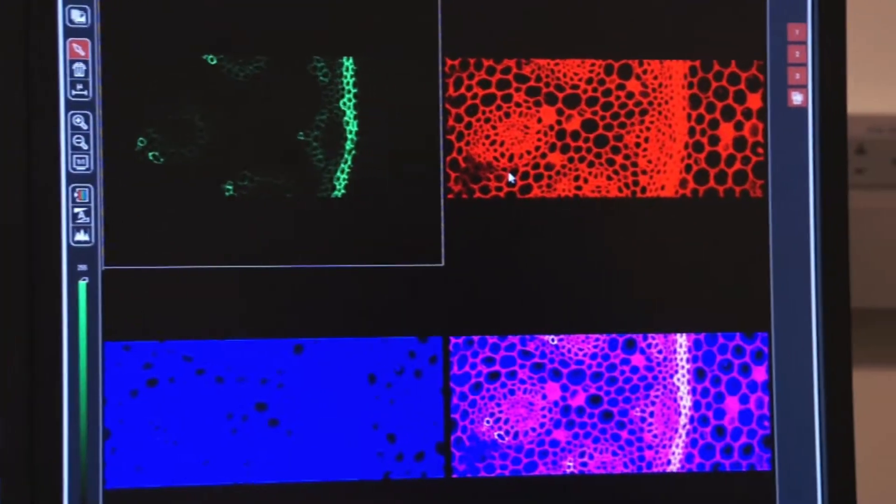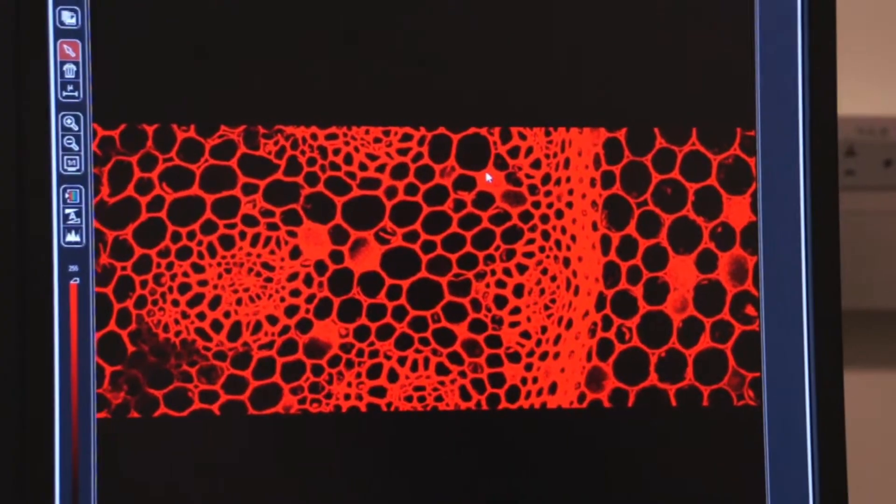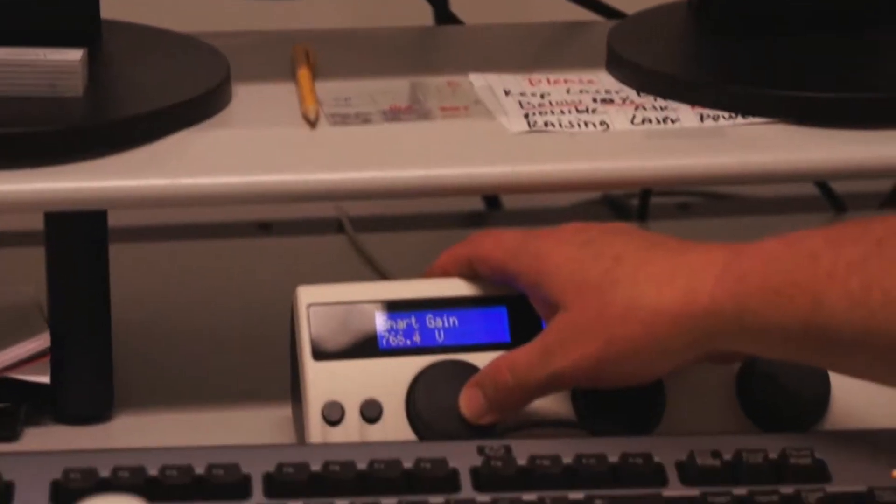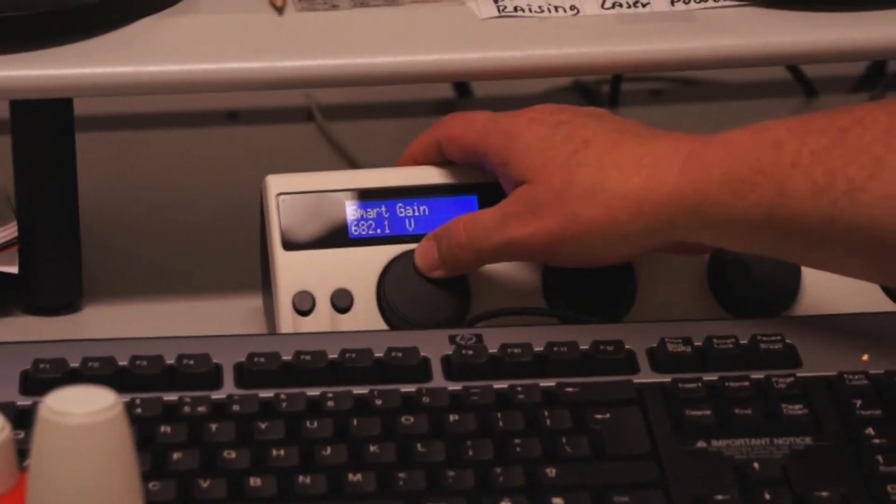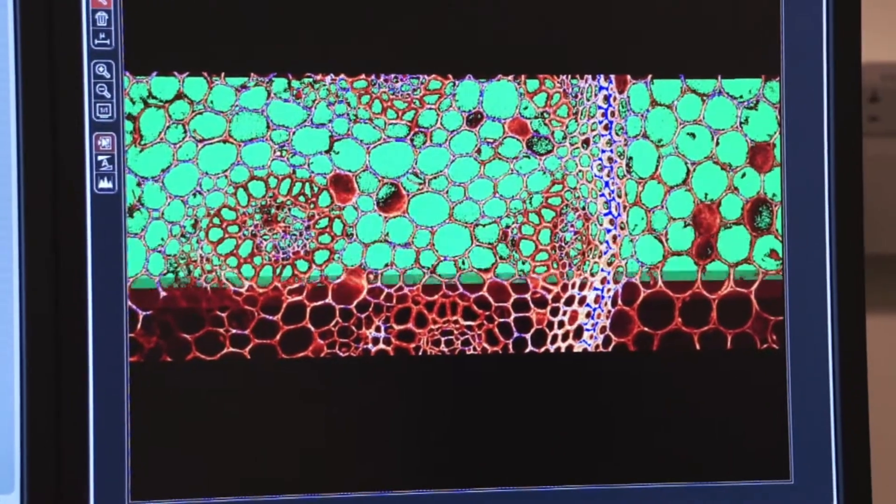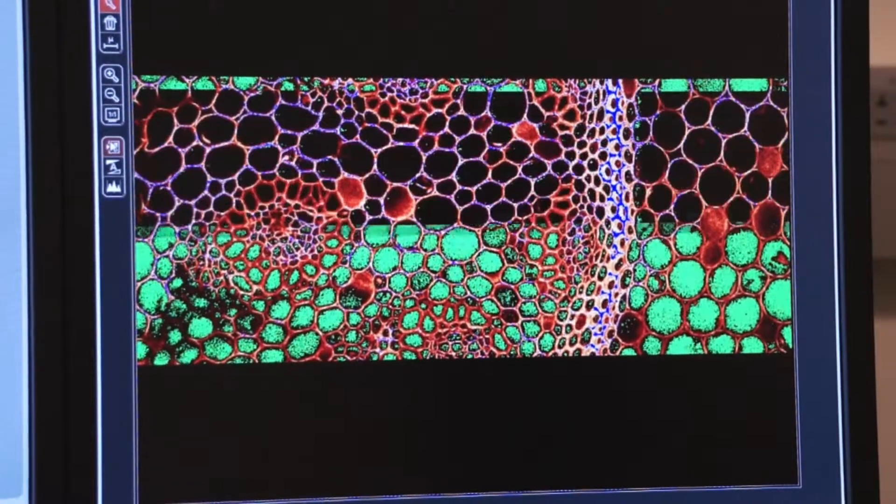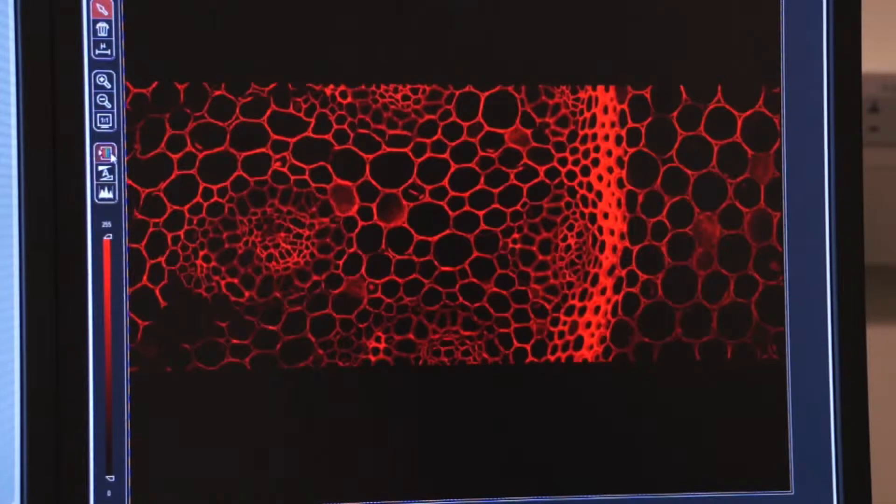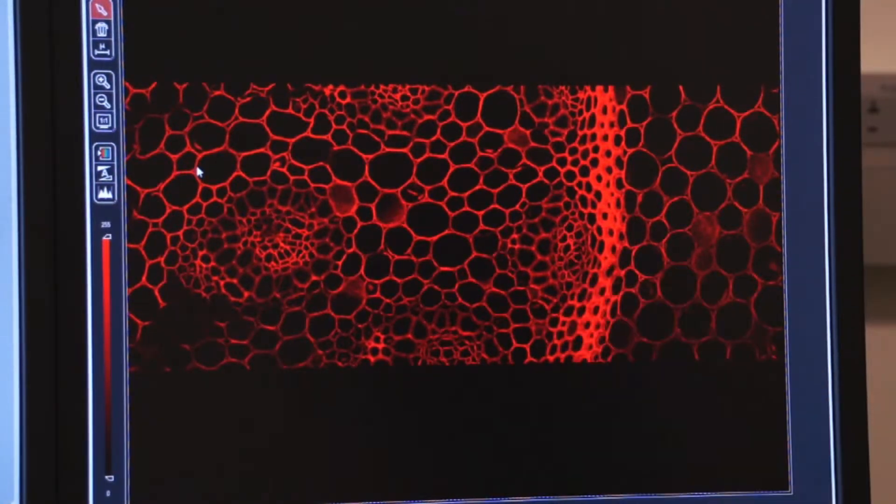Let's double click on the TRITC window, and now we'll set our smart gain and offset. We'll go to lookup table first. Too many blue pixels, so we'll lower our gain until our blue pixels start to go away. And we'll control our offset until our green pixels appear and then go away, right about there. We'll double click again on the lookup table. Now our TRITC looks very nice.